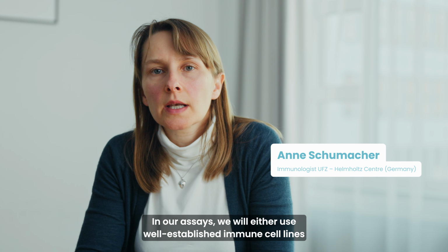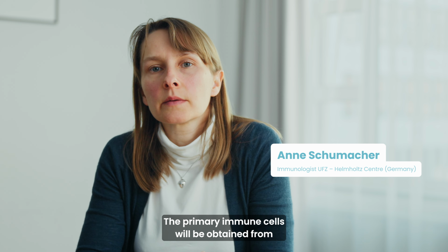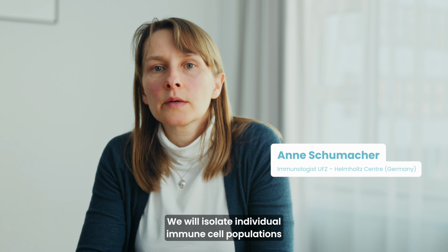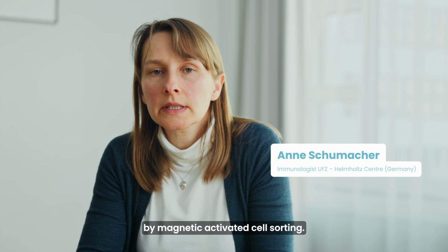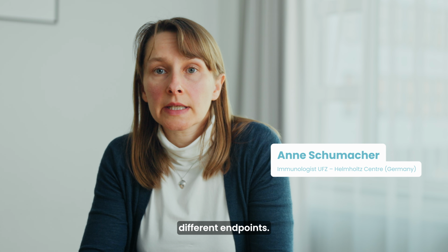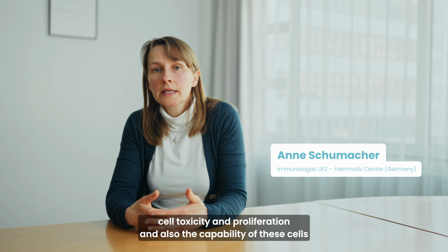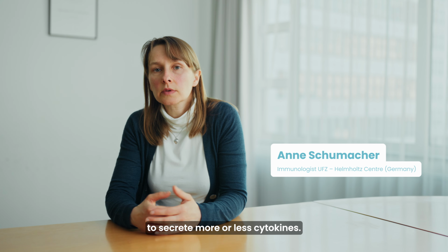In our assays, we will either use well-established immune cell lines or primary immune cells. The primary immune cells will be obtained from PBMCs derived from human blood. We will isolate individual immune cell populations by magnetic activated cell sorting. Then these cells will be exposed to either single chemicals or the chemical mixtures, and then we will study different endpoints. These endpoints will include general cellular parameters such as cell toxicity and proliferation, and also the capability of these cells to secrete more or less cytokines.